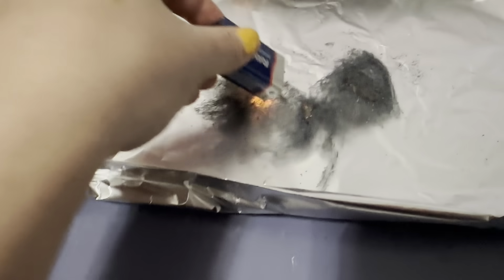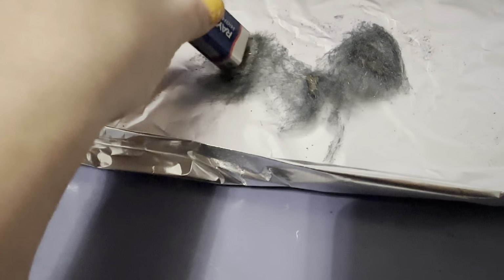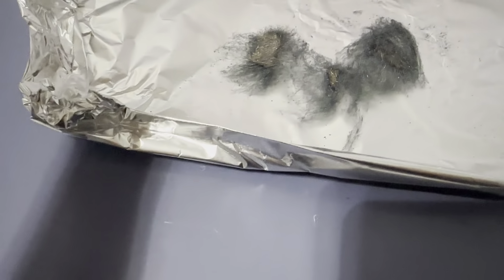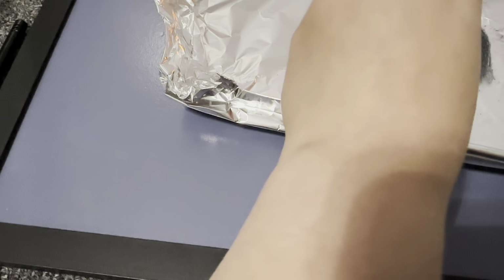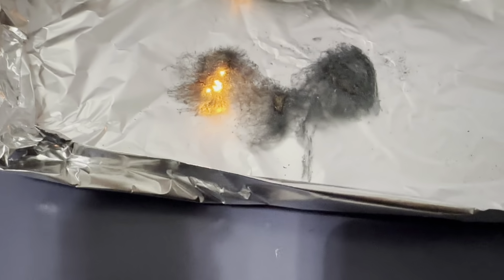This is a really fun reaction to watch. Oh, there it went a little bit. I might have some special coating on it. Oh, there we go. There we go, I got it. It's going to let it go. I had my battery positioned wrong. Okay, anyway, so that's going.